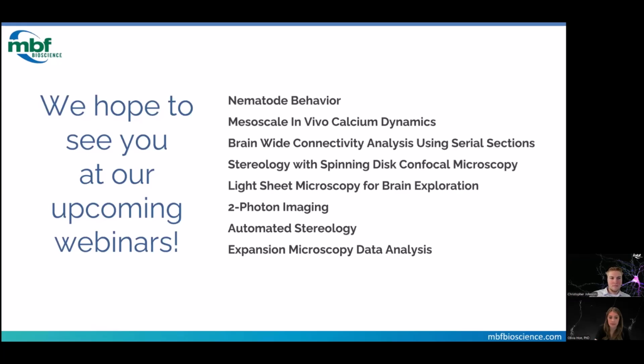Couple questions. So for signals that peak but have a slow decay, I guess with GCaMP, the kinetics are asymmetric typically, like a faster rise and a slower decay. Is there a mechanism you guys could build to detect the end of a peak instead of the beginning of a peak?